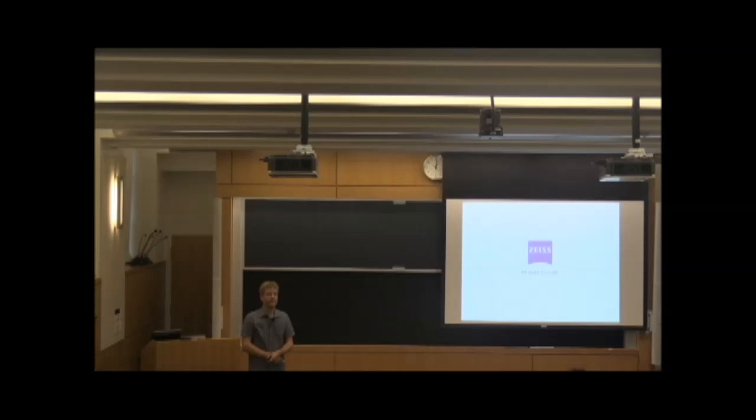One more question, sorry. When you're talking about the accuracy, I'm not too sure what's the difference between accuracy and longer exposure time. It seems to me the 5 frames of averaging and 5 times exposure time is just the same. Yes, that's right. So there's not too much of a difference. But for instance, if I had 5 times longer exposure time and 5 frames of averaging, probably the signal to noise would be more. Yeah, this would also reduce. Okay.